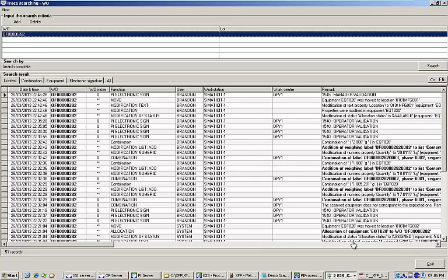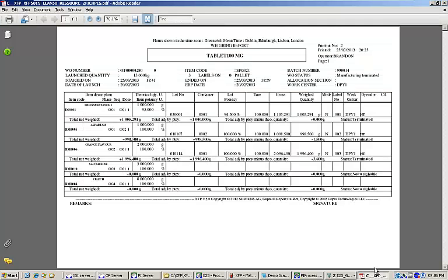Of course, since everything in the EBR is captured electronically in the database, it is also possible to generate reports on any of your batch data. Here's an example of the weighing report that shows all of the materials weighed against the work order.